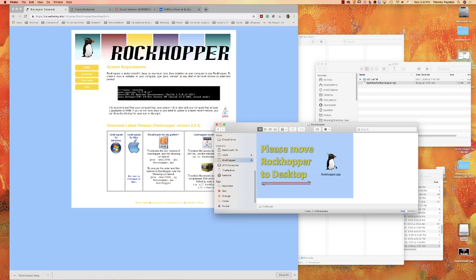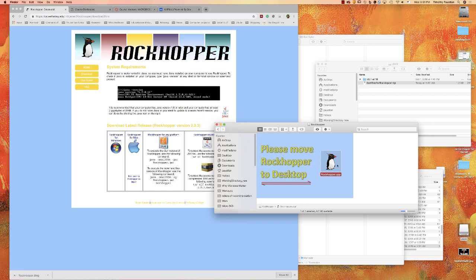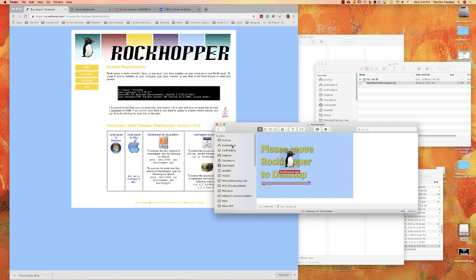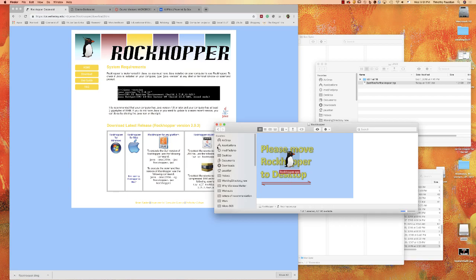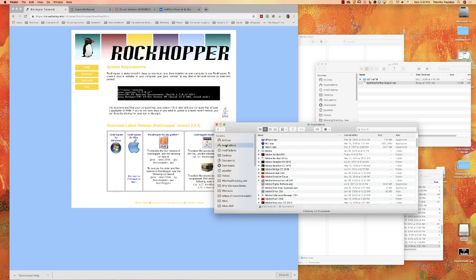It basically says please move RockHopper to the desktop. You don't have to do that — you can actually drag it and drop it into your applications folder. So I'm just going to drag it and drop it on the applications folder, and then it will copy it. It's now copied to my applications folder.